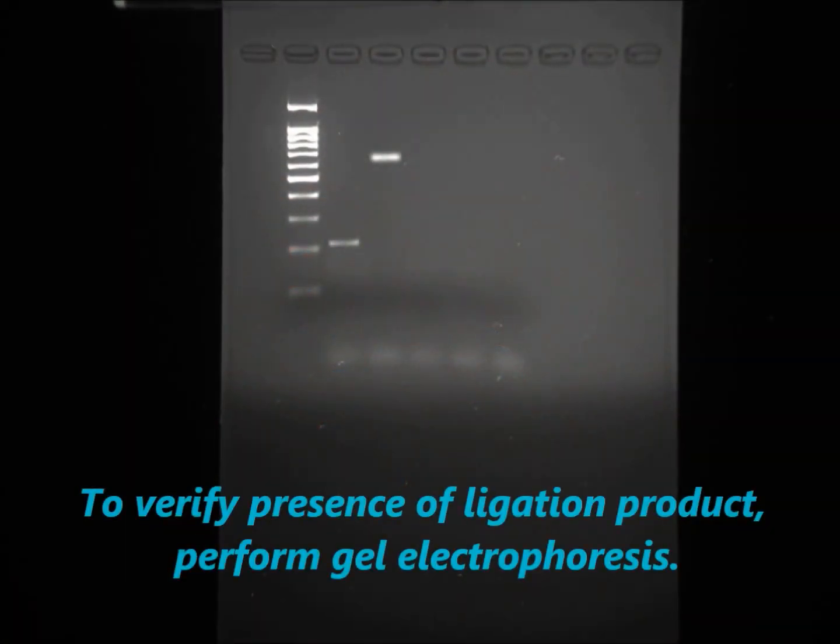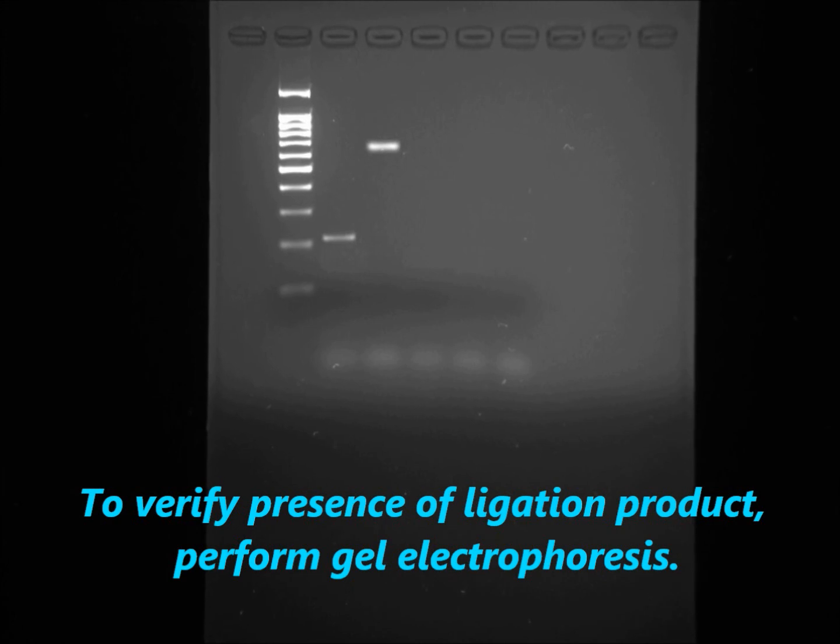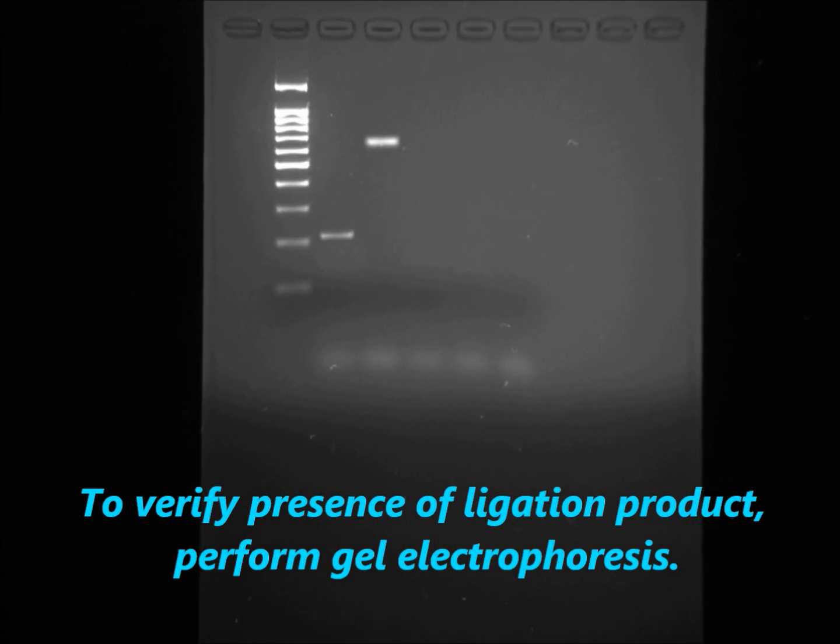If you wish to verify the presence of DNA in the tube, you may perform gel electrophoresis to check if there are bands of the expected sizes.